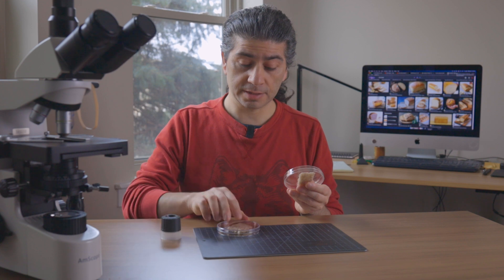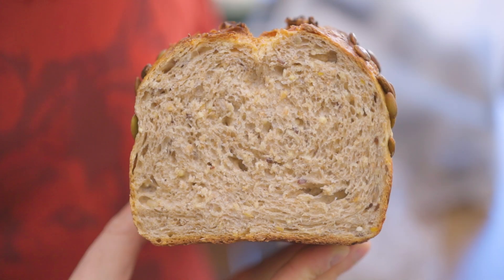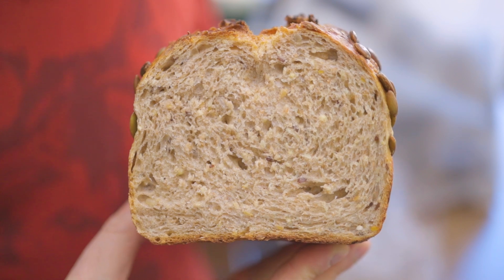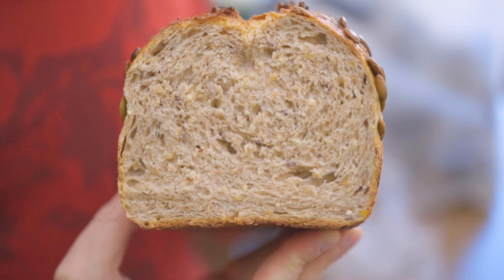Here is a cutout from a fresh loaf of bread. And this is from our moldy bread, infested by hyphae. The inside of the bread is full of tunnels and caves — a perfect place for hyphae to thrive. They are so thin that even under the microscope, it is impossible to determine which bread is fresh and which is moldy. You can stop squinting — the fresh one is on the right.